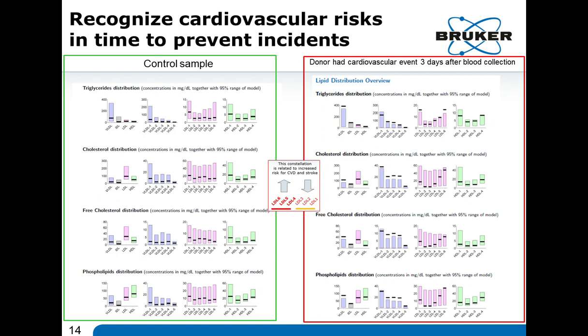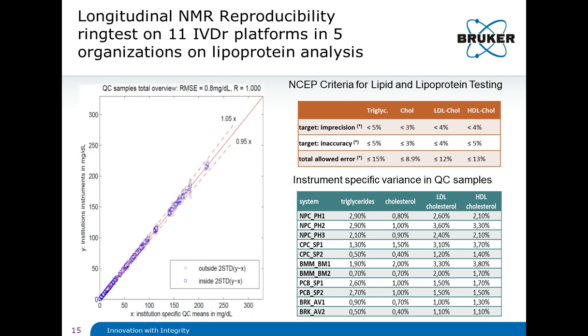But if you look at the individual subclasses, you can see that this distribution actually is quite unhealthy, because health is improving when we have a high concentration of the first 3, LDL 1 to 3, and a low concentration of LDL 4 to 6. And here it's vice versa. But if you just take the main panel that you would get from your house doctor, he would not recognize that there is a problem. NMR can do that within a few minutes.